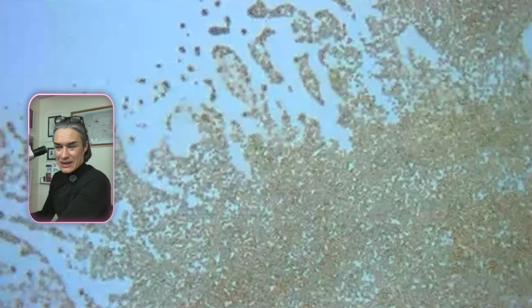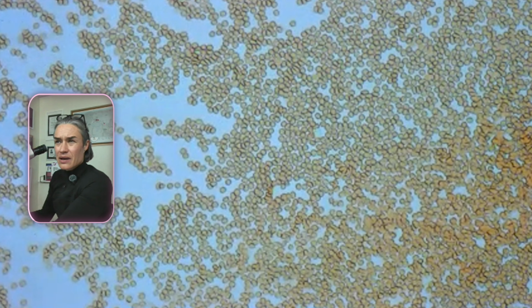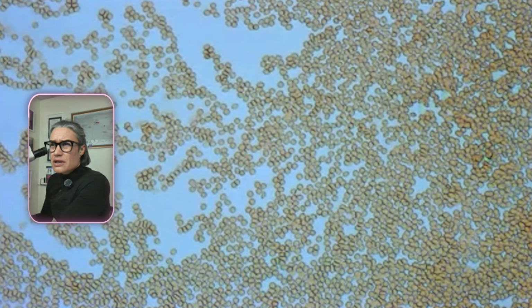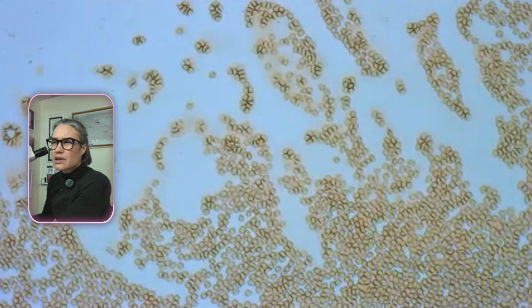Oh, I see. They're not stains, my friends. This is my blood. Not too bad. We're going to go higher magnification. Ooh, nice. Mostly red blood cells, right? And if you smear them thin, then you can see them separately. Okay, not too bad. Let's see if we can see any white blood cells. So this is without any staining. It's just straight from my finger. Dramatic demonstration for what's in the blood.